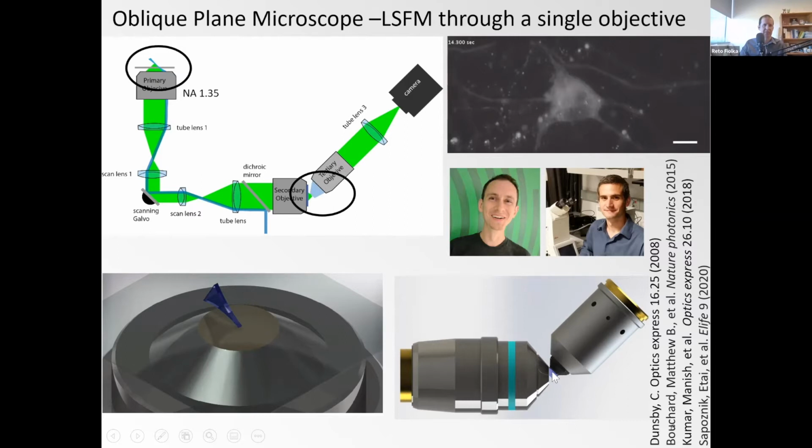This lens essentially has a theoretically very large solid angle that it can collect, and as such limits the light losses and makes the OPM concept more light efficient, but also higher in its resolving power. And so that caught our interest, and we started working on this concept.